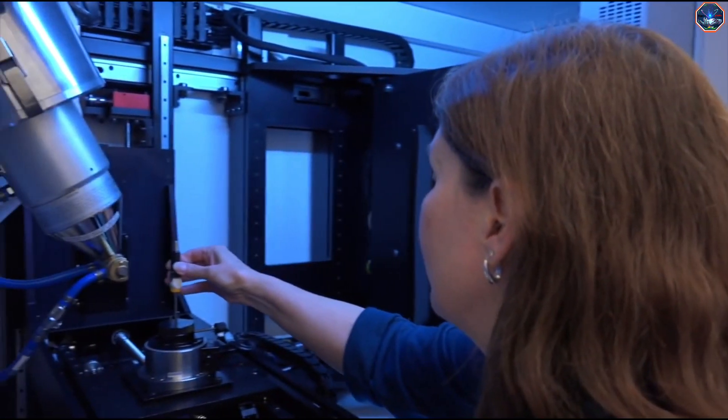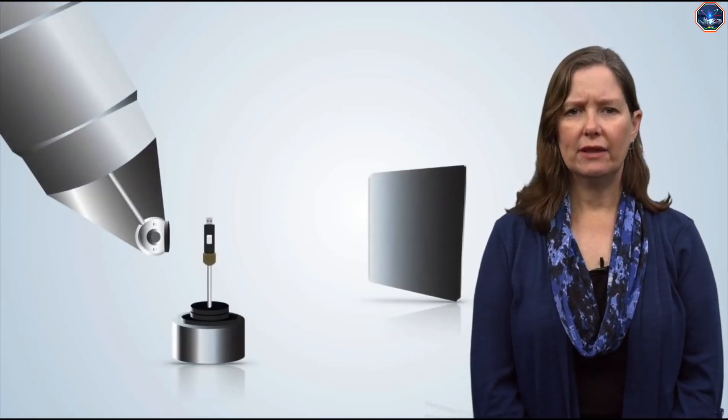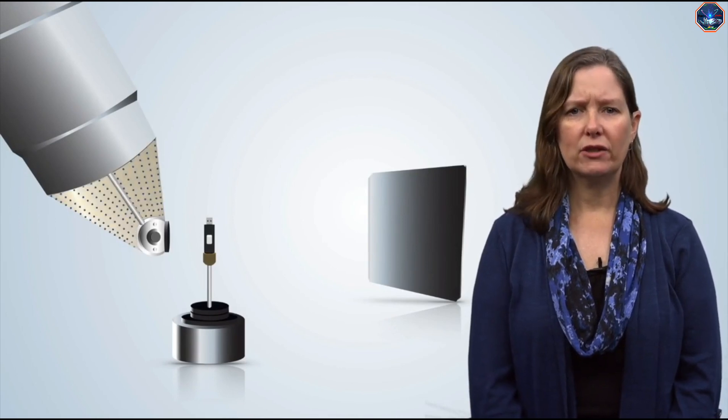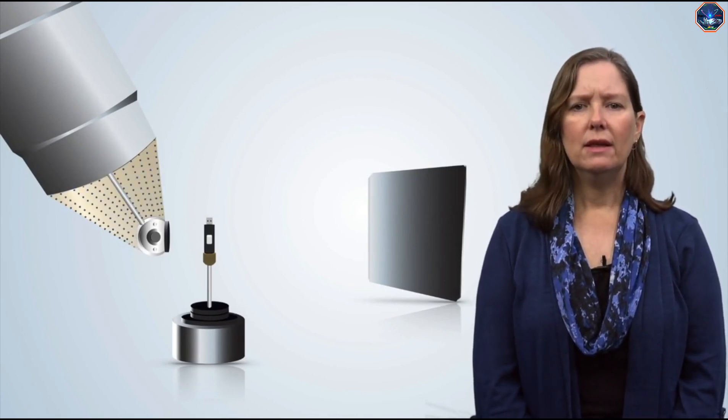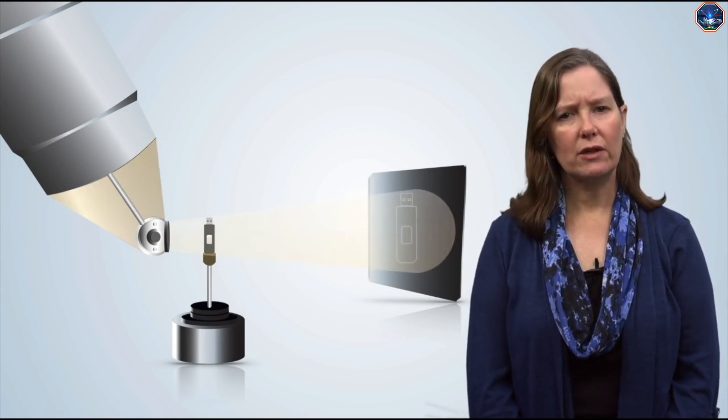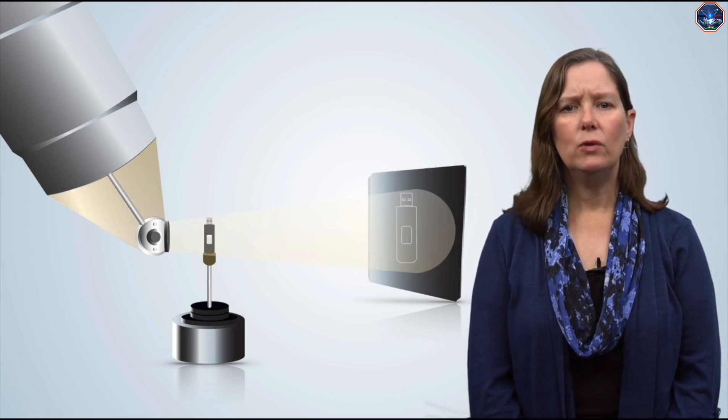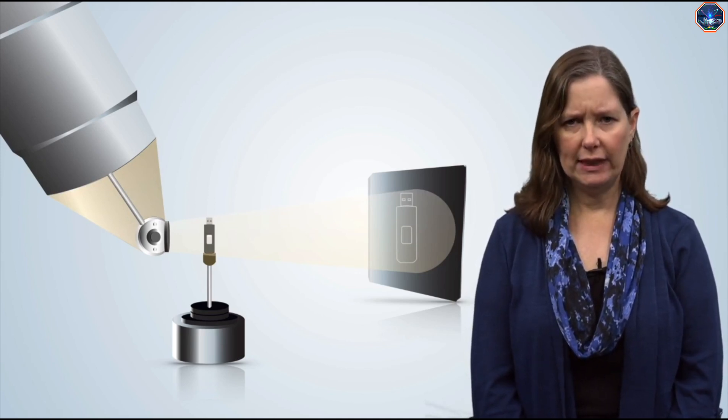Now, let's discuss the operation of the MicroCT. We will be using a USB drive as our sample. The MicroCT generates x-rays by shooting electrons through a vacuum and hitting a tungsten target. These electrons interact with the tungsten to produce a cone of x-rays that shoot out toward the sample sitting on a central stage.